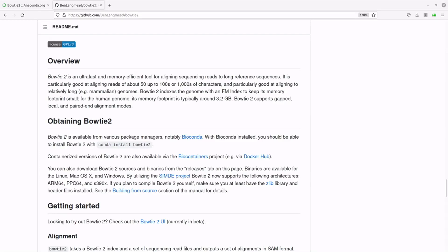Hi everyone, welcome once again to another tutorial session in Bioinformatics. In today's video, I am going to show you how you can install Bowtie2 in a language environment using Conda. Bowtie2 is a tool that is used to align sequence reads to reference sequences, and you can read more about it on the GitHub page.